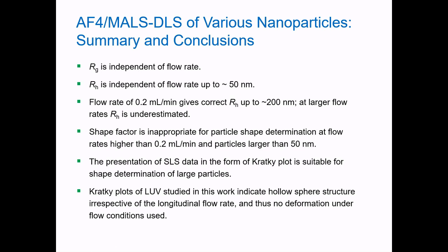Therefore, the particle shape of large particles cannot be inferred from the shape factors determined at fast longitudinal flow rates. In such cases, particle shape can be extracted from static light scattering data presented in the form of Kratky plots. Our vesicles did not undergo deformation under the flow conditions used in this study, as indicated by their Kratky plots.